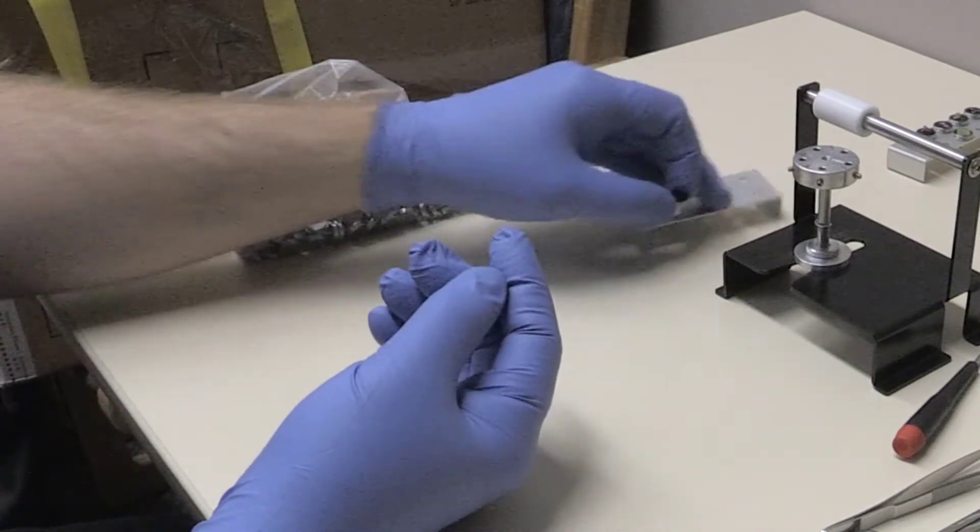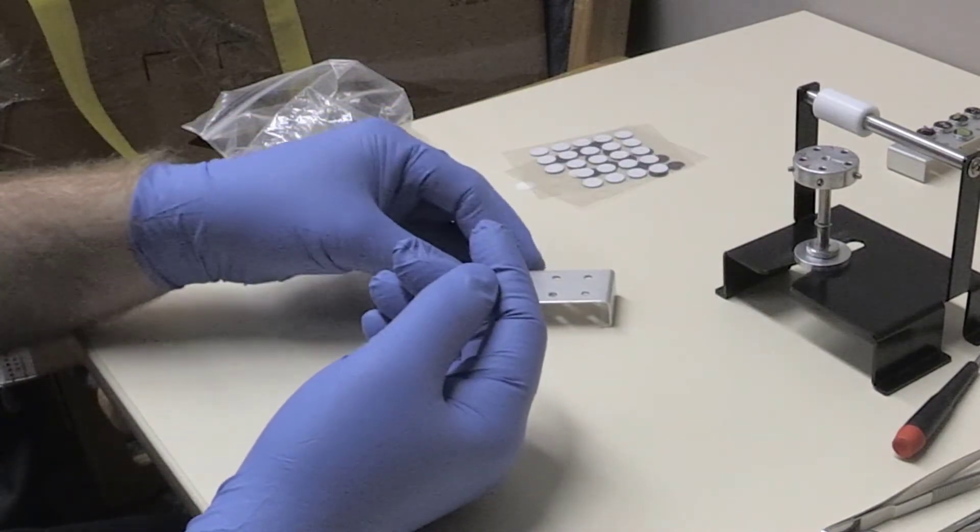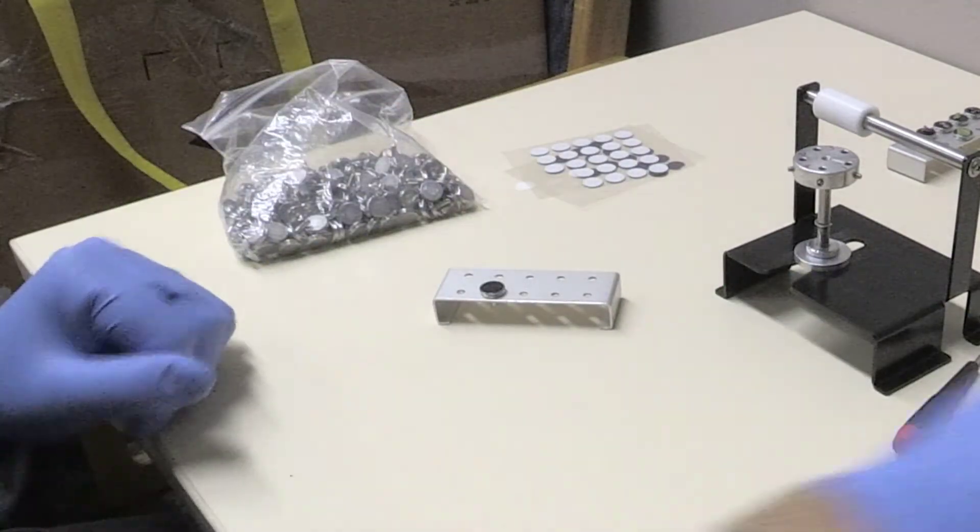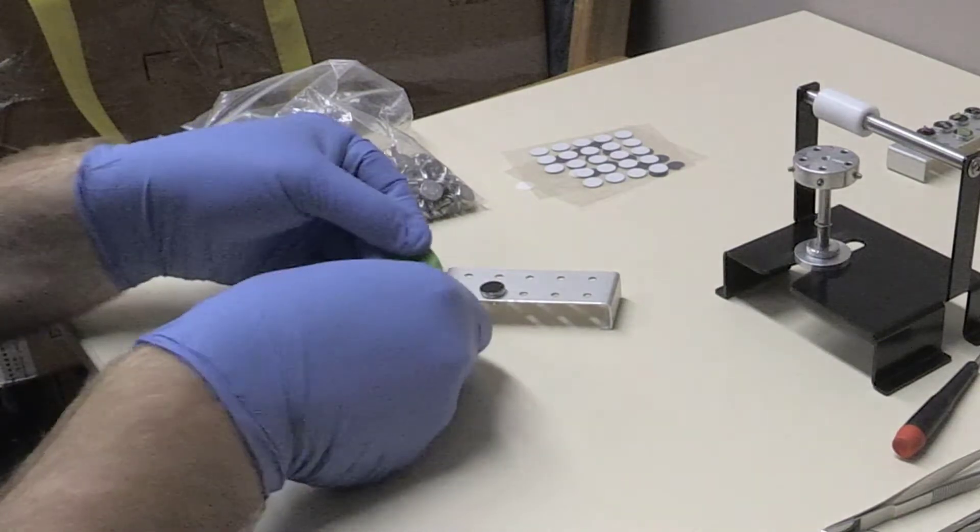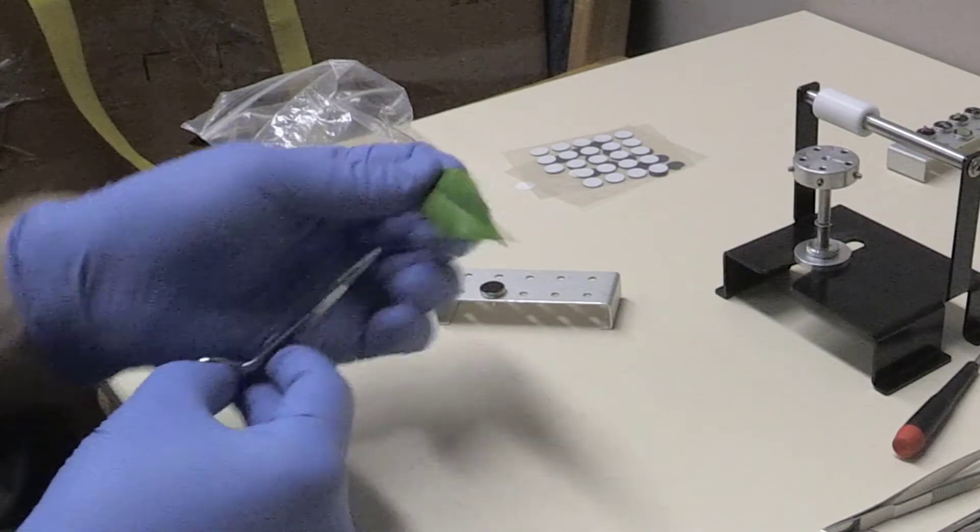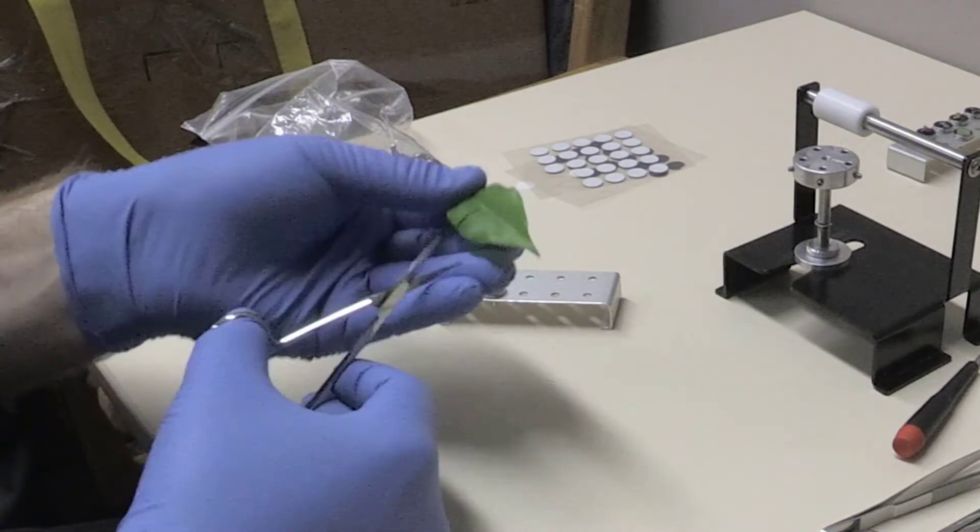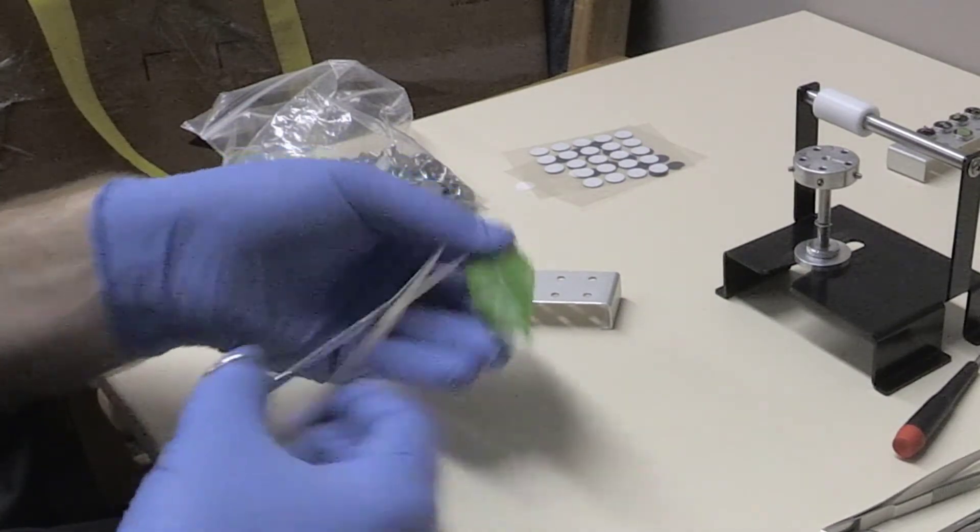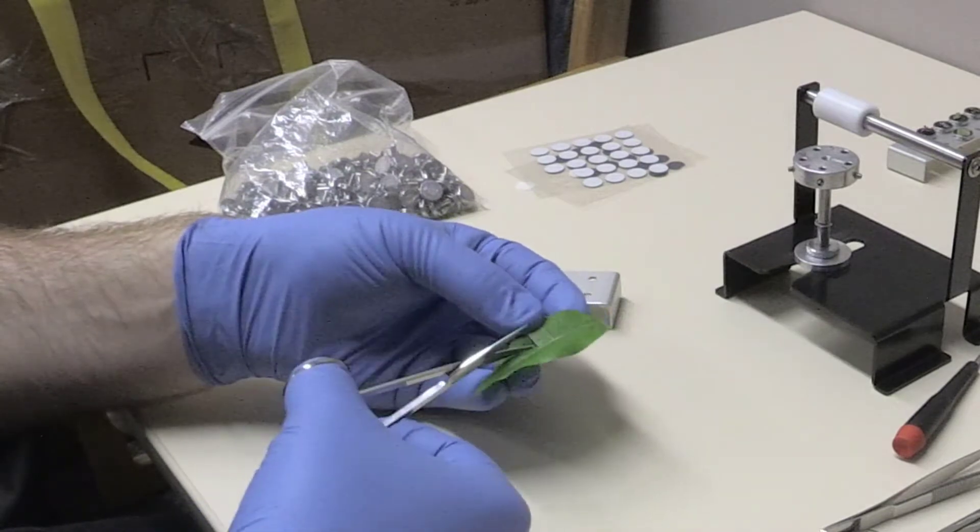Specimens may be added to the device whole. They also may require some level of preparation. Specimens that are too large to fit on a mounting pin will have to be cut or broken up in some way. A large leaf, for example, may have to be cut into smaller pieces. A rock may have to be split into chunks.